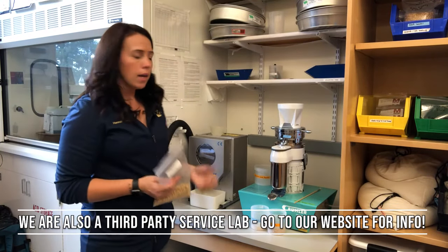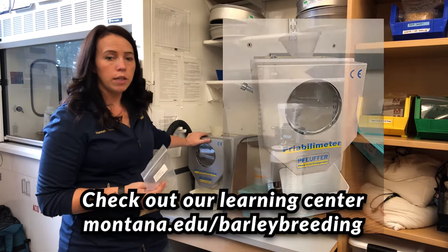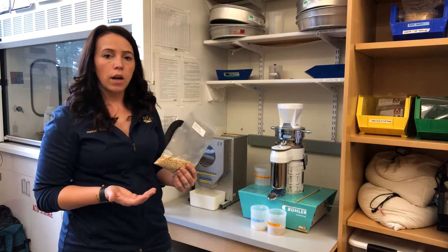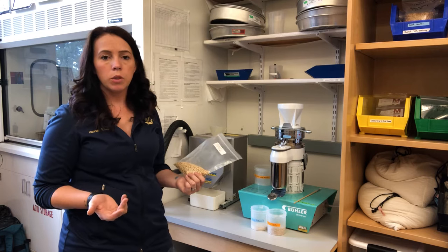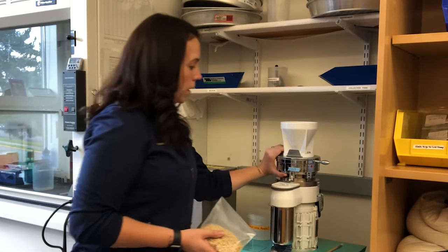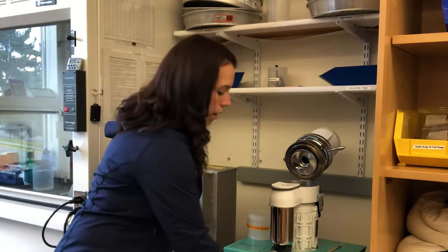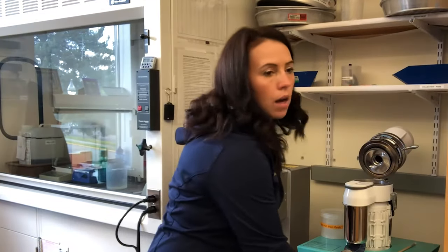Some of the first things we'll look at — we might run friability. We do actually have a pretty involved video showing the process and maintenance for that unit. The next thing is we'll grind up the malt. One way to think of malt quality testing is that a lot of what we do is very similar to the initial stages of brewing: we mill the grain, mix it with water, mash it, create a wort, and the majority of our testing is done off of that wort. For milling, we've got this Buehler Disc Mill — it's a disc mill with two discs, and based on how far apart or close together they are, that creates a fine or coarse flour. We'll measure both samples for extract, which gives us an idea of what the modification process looked like during malting. From there, we'll go over to our mash bath and mix it with water to get that process started.